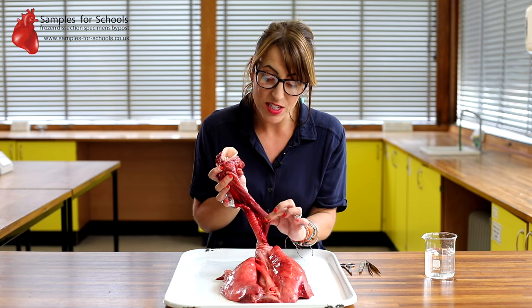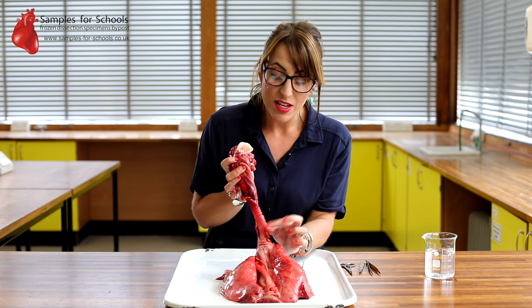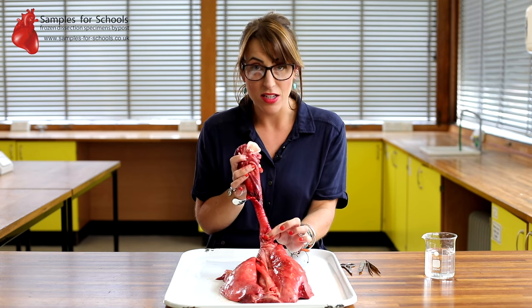This soft, flexible tube, that's the esophagus. This more rigid, slightly striped tube, that's our trachea. And that's the one we're looking at because it takes the air into the lungs.